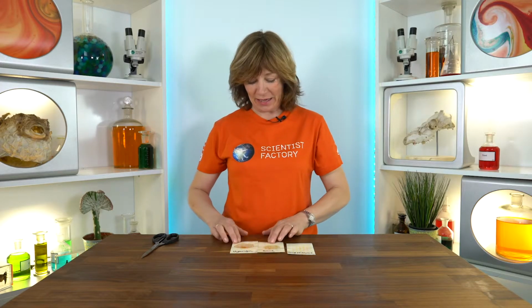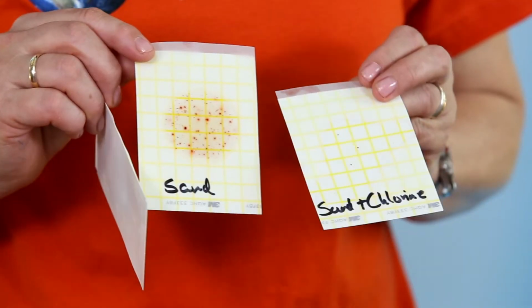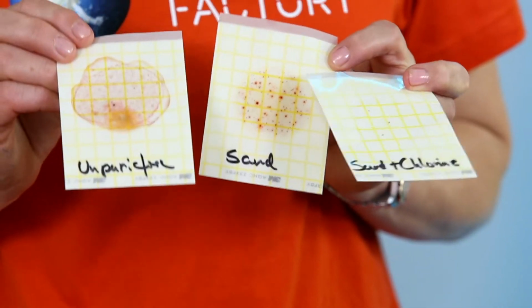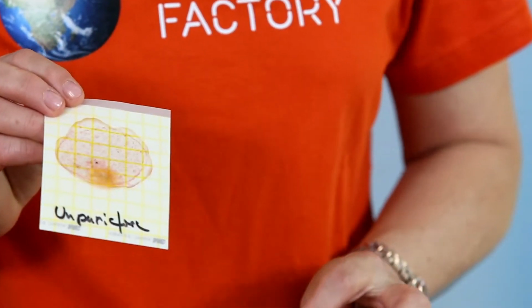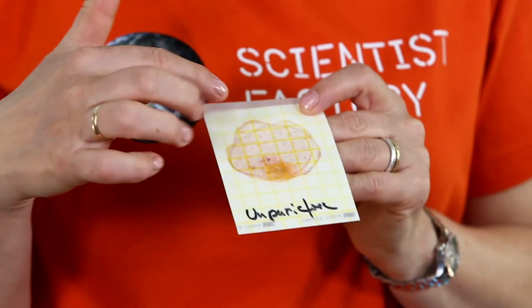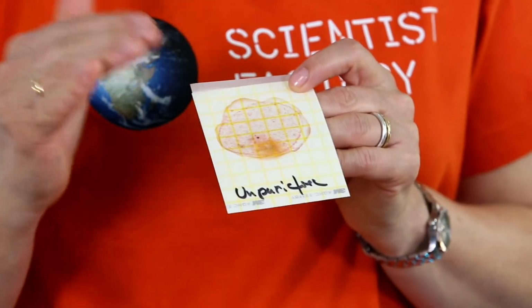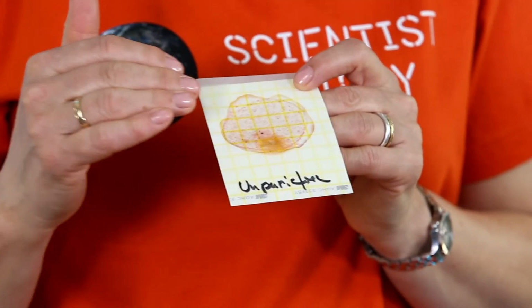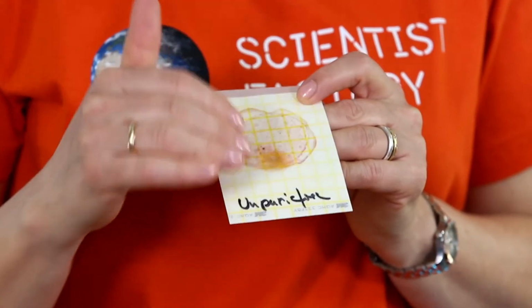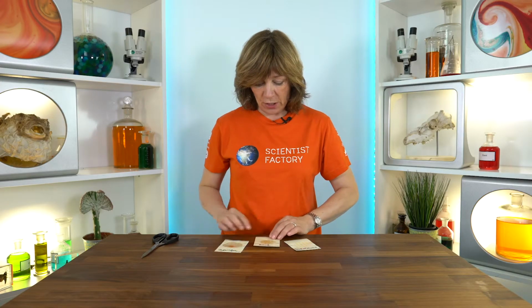Okay, now a few days have passed, and these are my bacteria films. And as you can see, there are several colonies on all films. This was the unpurified dirty water, and here I have a lot of small dots. And each dot is one colony. And of course they have a huge competition here in getting nutrients, so they don't grow very big, these colonies.